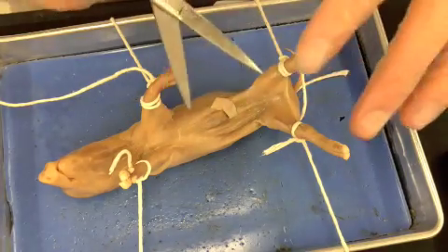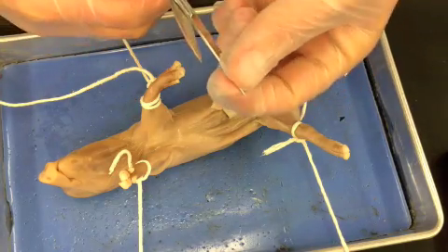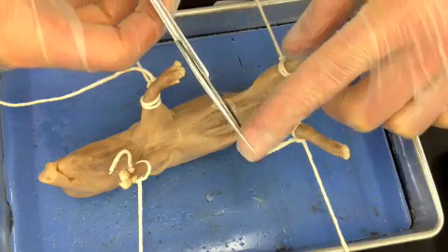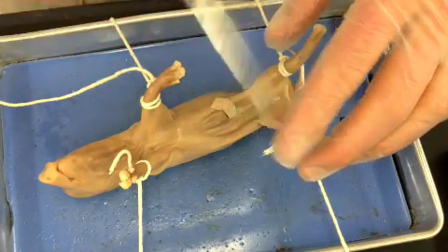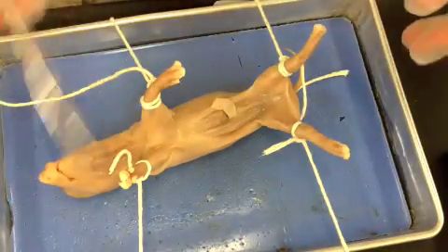Whenever you're cutting with your scissors, the technique is to take just the point of the bottom part of the scissor into the skin, and as you go to cut, you're going to pull up when you cut. This prevents you from going too deep and hitting an organ. Every time you pull up, you ensure that you're cutting the skin or the muscle and not cutting through any of the organs.